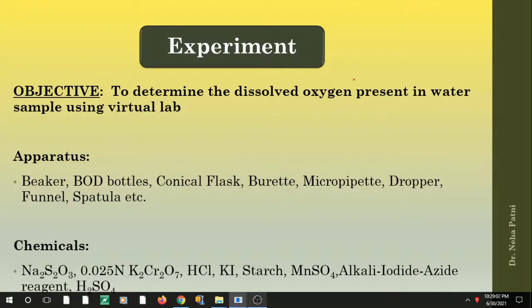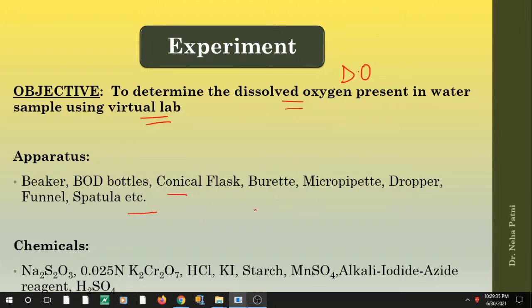The aim of the experiment today is to find out the dissolved oxygen — I'll represent it as DO throughout the session — present in the water sample using virtual lab. You can see the apparatus here; these are the same apparatus you use in a chemistry lab: beakers, bottles, flasks, burette. The same apparatus we are going to use, but online — a virtual approach.